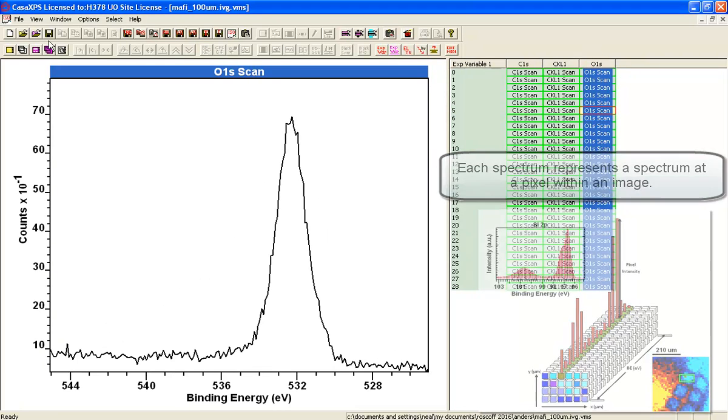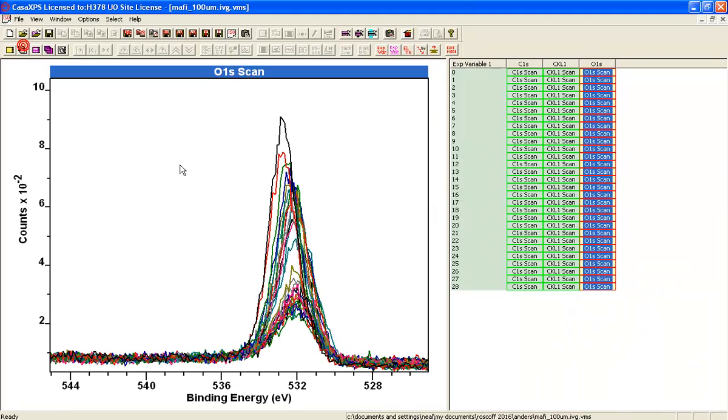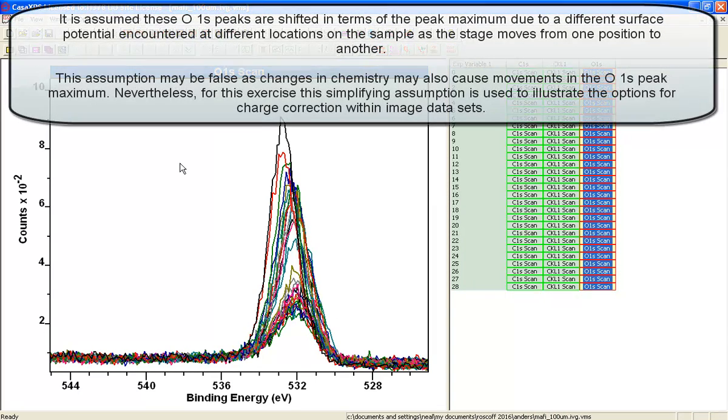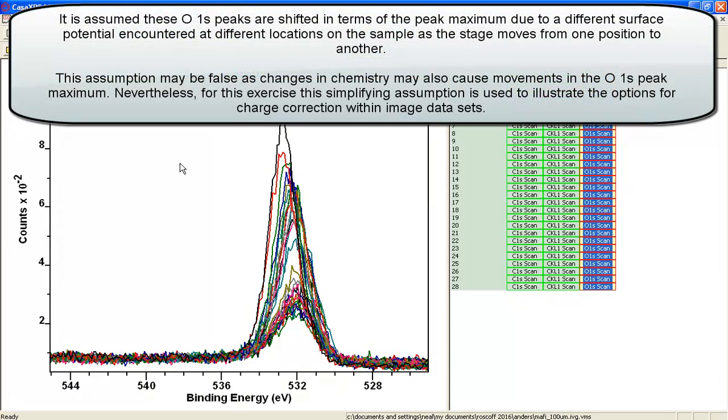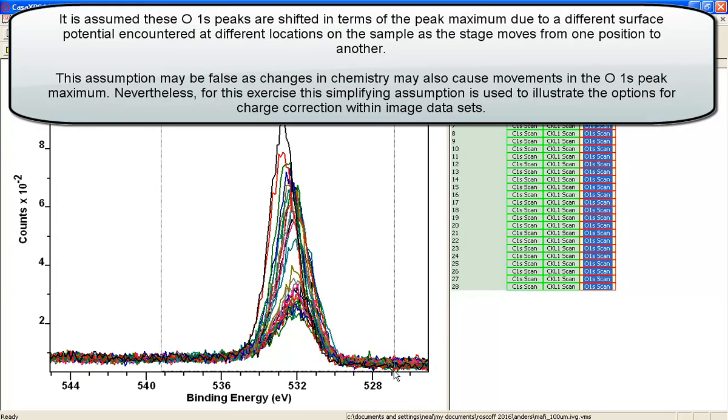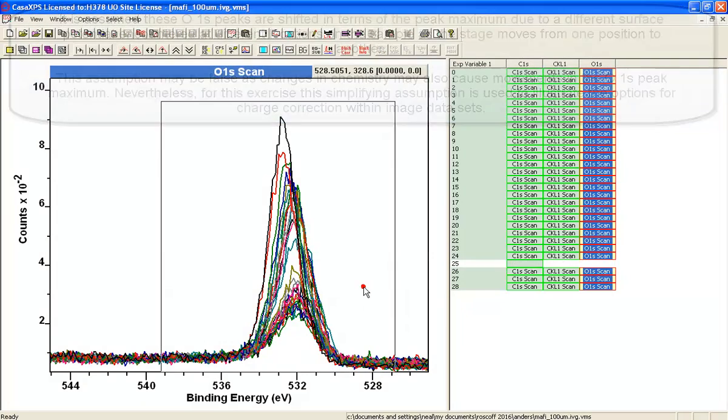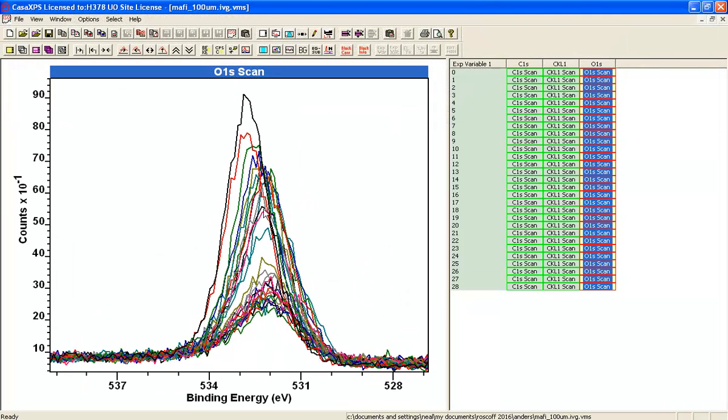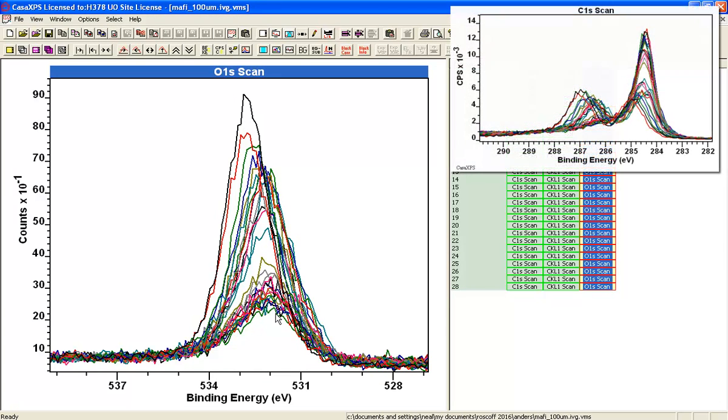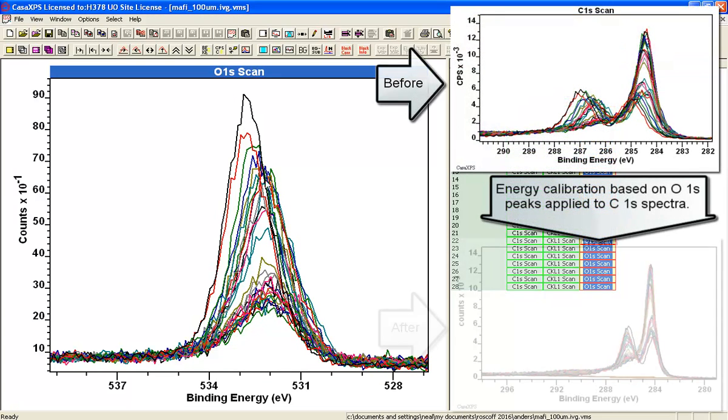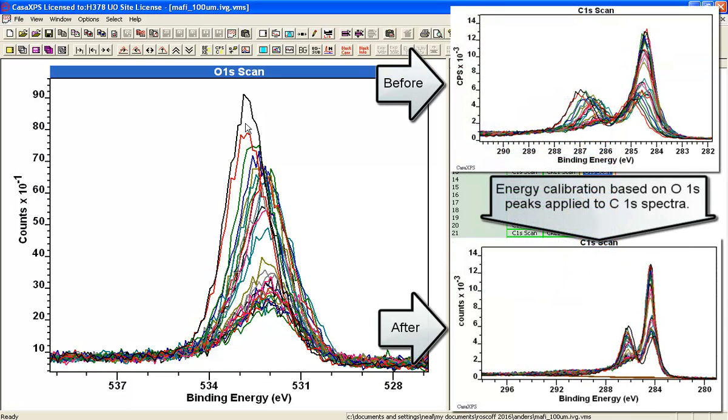What we would like to do now is illustrate how to do charge correction for such a data set. The reason that charge correction is required is because when we overlay the oxygen 1s, you can see that we have a range of possible positions that could be allocated to these peaks.